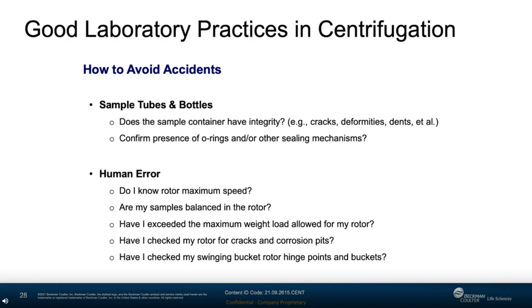One really important practice is whenever you start a centrifuge, you should know exactly how to shut it down. Press the stop button, turn the speed to 0, turn the time to 0. You need to know how to do that before you press the start button. Panicking is bad when something goes wrong. And once you do that, step away from the centrifuge. I'm glad to know it probably will be contained, but better safe than sorry.